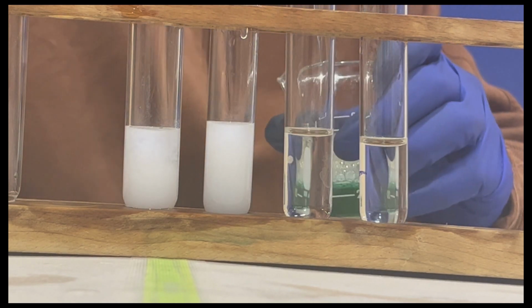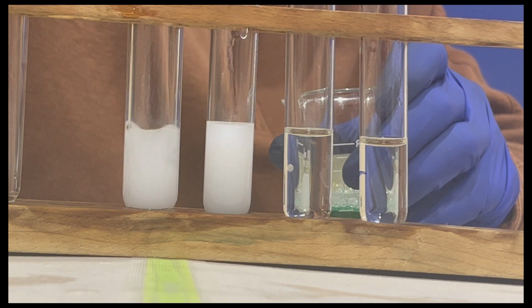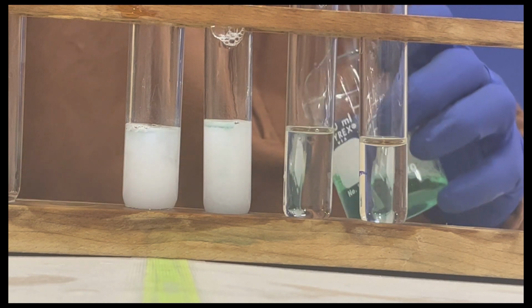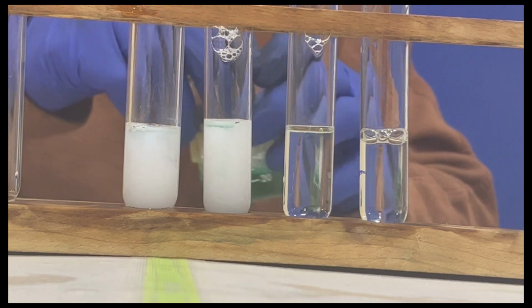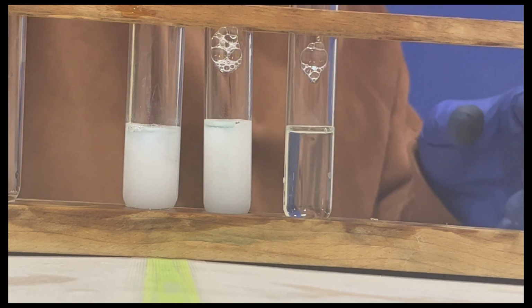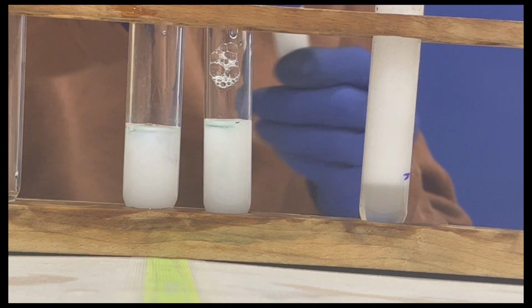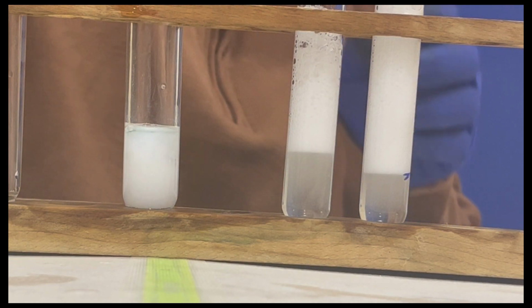So we put into each of them equal amount of soap solution. And then we compare the degree of lathering with what we obtained before. Okay. So we'll do this one first. This is the one with distilled water alone. The lathering we get there, we expected that. That with sodium ions there, nearly same as that there, no change.